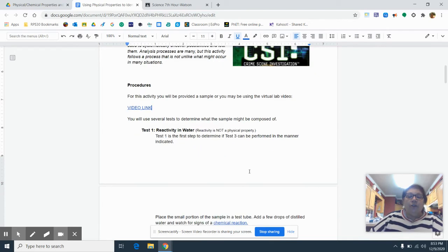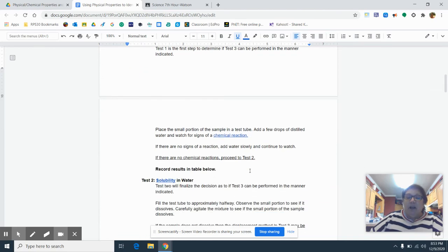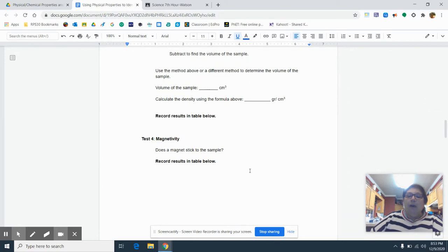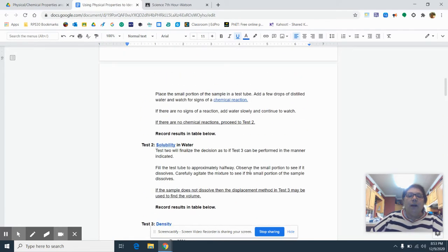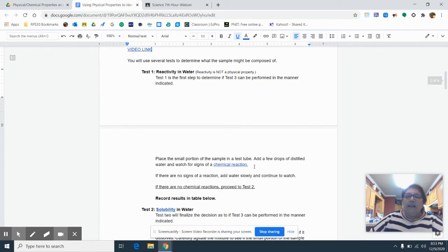You guys are going to watch and observe and write down your data for 1, 2, 3, 4 tests. The first one, he's going to show you if it's reactive to water. And it explains what he's going to do. If there's no chemical reactions, proceed to test 2.